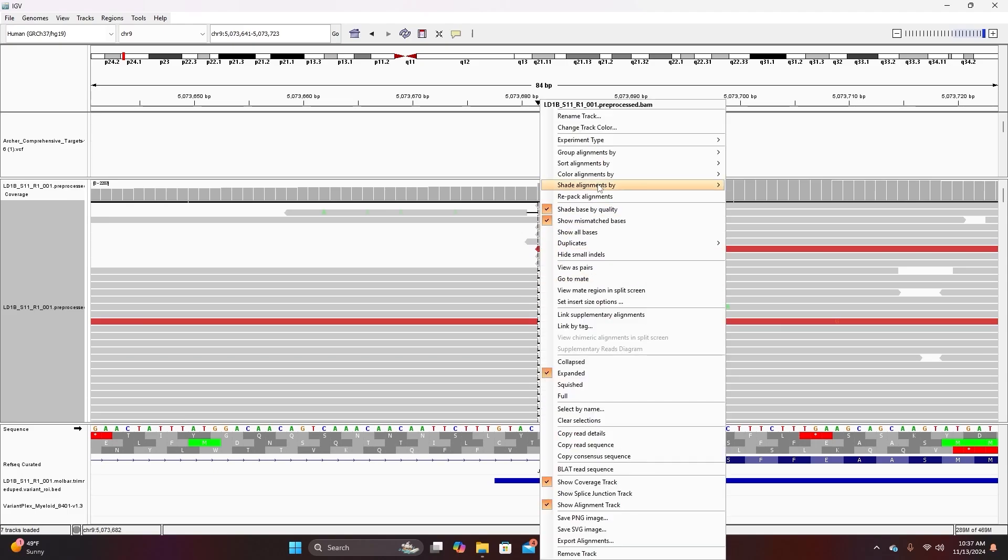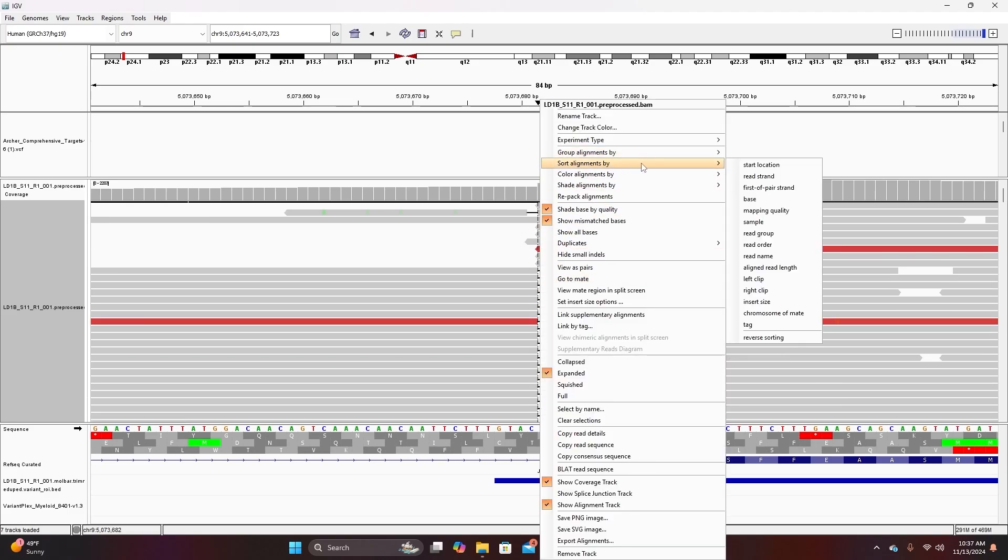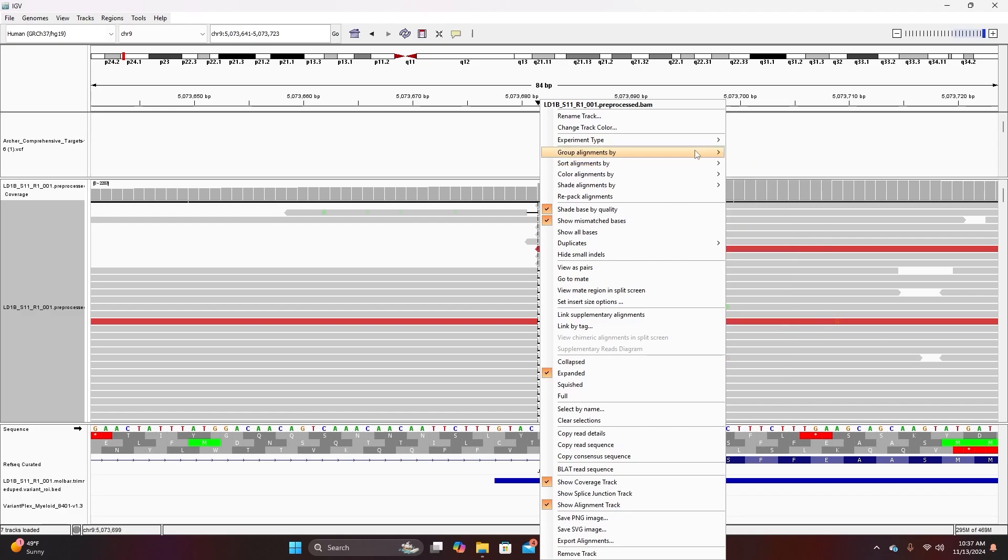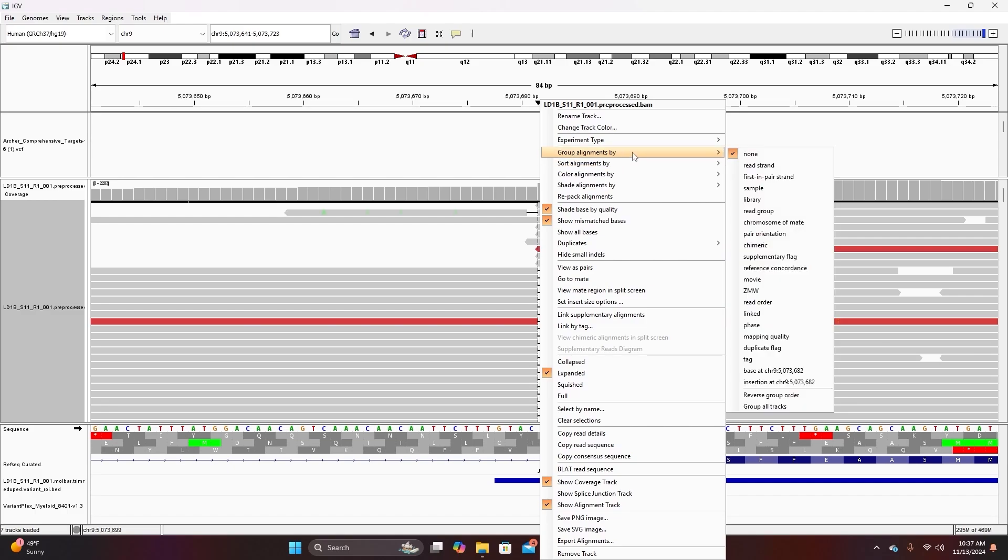There are many different sorting options. You can sort by quality scores such as mapping quality. You can reverse sort and you could just read through these and experiment with them. But that's where the sorting options are. You can also group alignments.